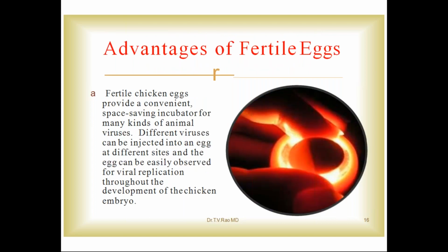What is the advantage of these eggs? These eggs provide a convenient, space-saving incubator for many kinds of animal viruses. Different viruses can be injected into an egg at different sites, and the egg can be easily observed for viral replication throughout the development of the chicken embryo. That is why we use the embryonated hen egg. We can observe the development of the virus inside.